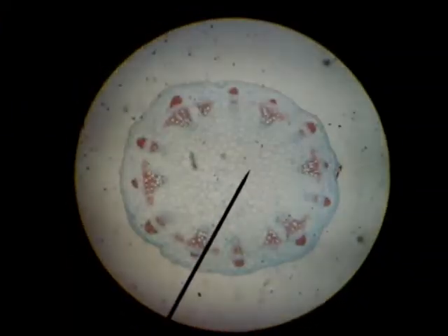This is a cross section of a stem of a dicot showing the phloem and xylem. The phloem is on the outside.